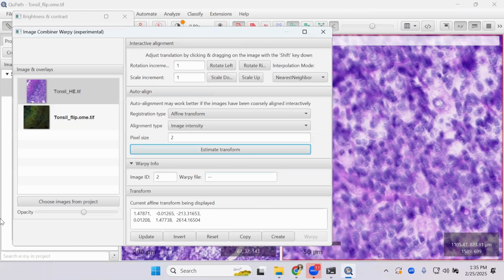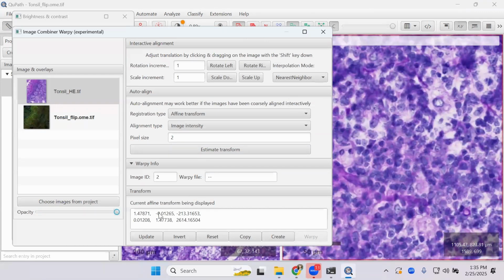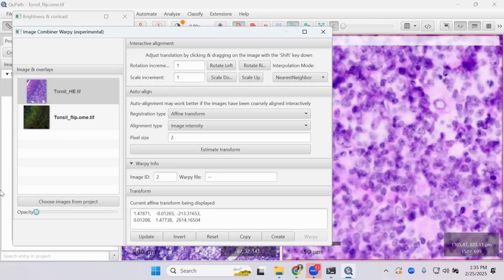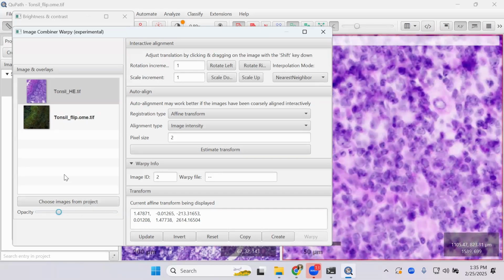And I'm now going to be adjusting the opacity slider, and I go between one and the other image. And you see that this alignment is pretty good, but there's still room for improvement. They're almost next to each other. So it might be the point where you're going to say, this is good enough for me, because my computer took a very long time to get to that point. If that's the case, this is fine. You can leave it at this.